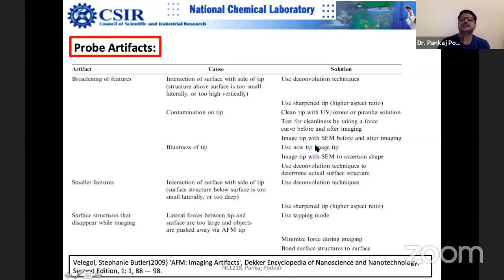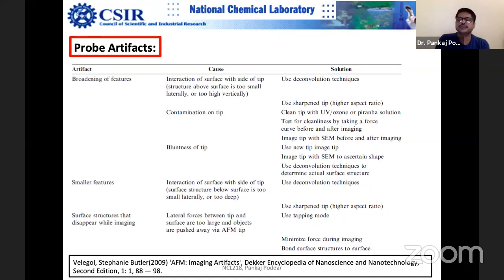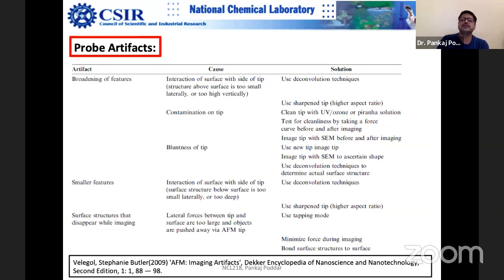Another solution is imaging the tip before and after your work using scanning electron microscopy. By comparing the tip's intactness before and after use, you can verify probe quality. This should normally be done for every probe used in published data — you must have a clear idea about its dimensions and have high-resolution SEM pictures of the probe before and after use. This confirms that the tip has no contamination and has not been altered during imaging.